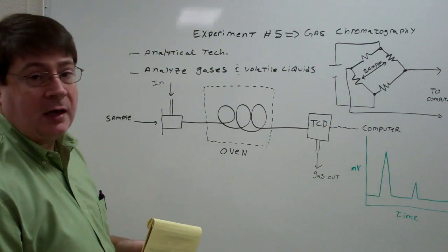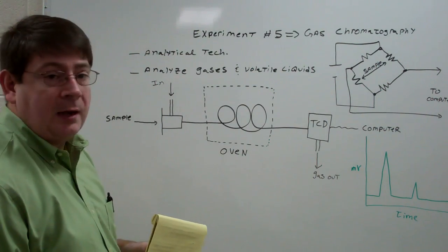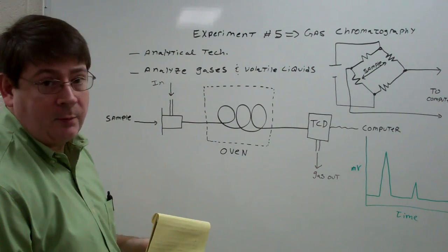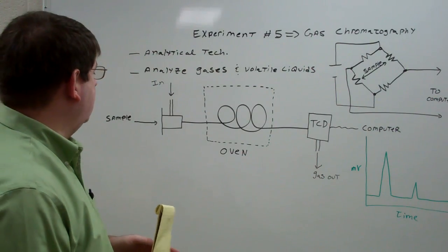Your TA is going to actually show you how to use the GCs that are in our lab, so they'll spend some time with you talking about that. And in this lab, we're going to be analyzing those samples that you obtained last time during the distillation lab.